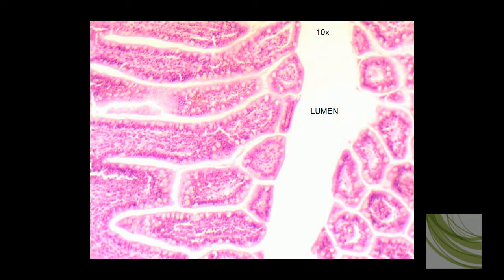Now here we have increased our magnification, and we're using the 10X objective to look at this tissue. We can see a little bit more. Again, here is the lumen, and you're going to find the simple columnar on the edges of these villi.